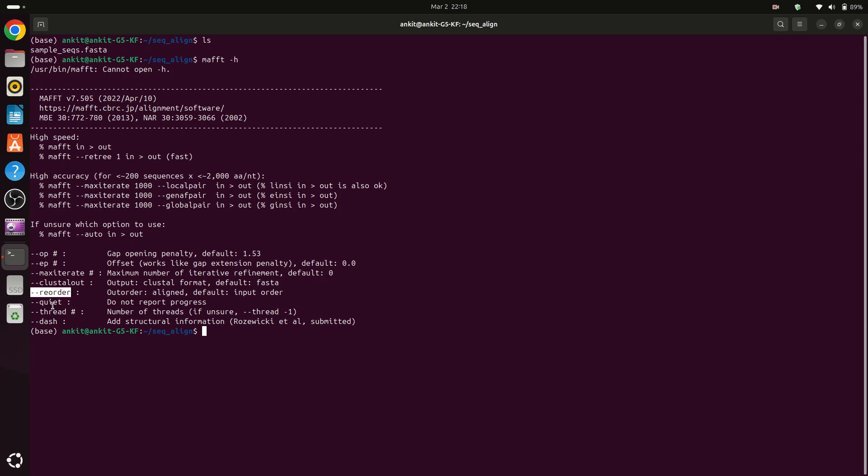Then --quiet if you don't want any output during the run. Then this is the important option because because of this we can use multiple CPUs from our system so the speed of our alignment will be increased.